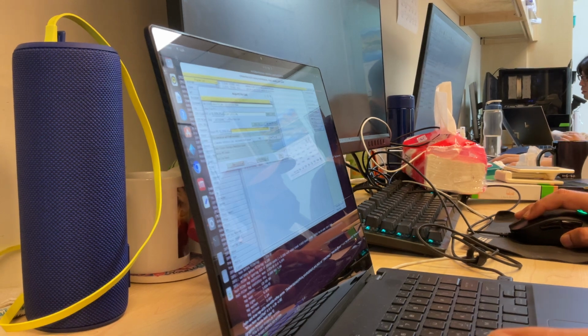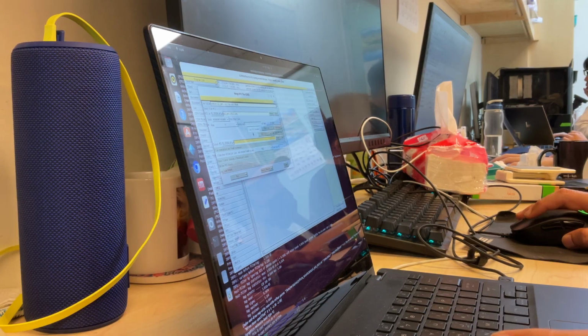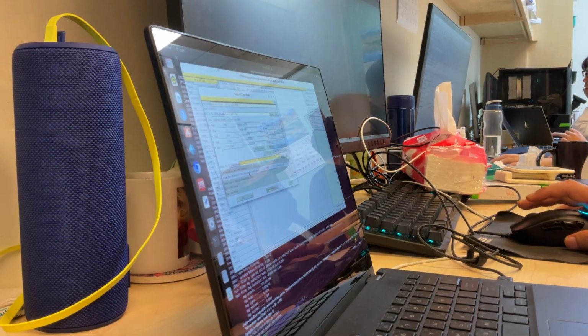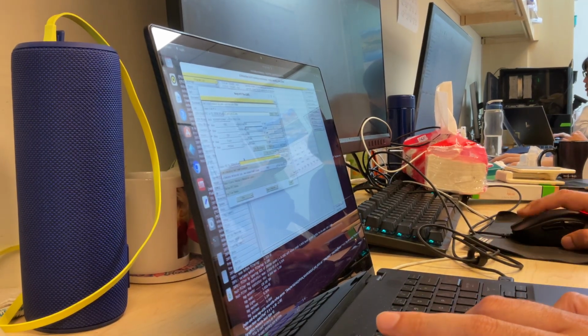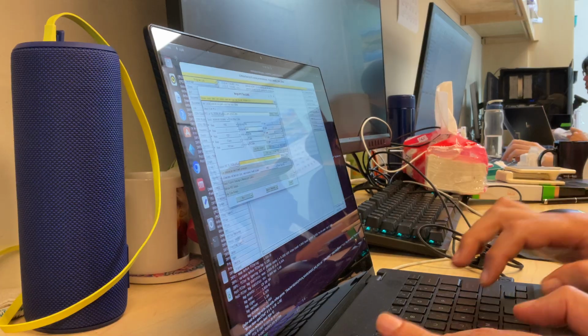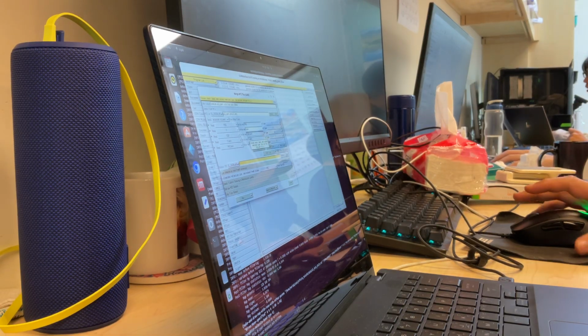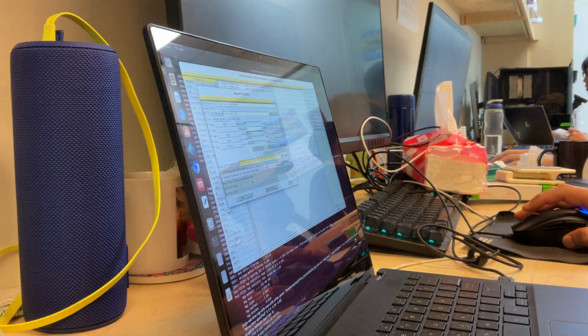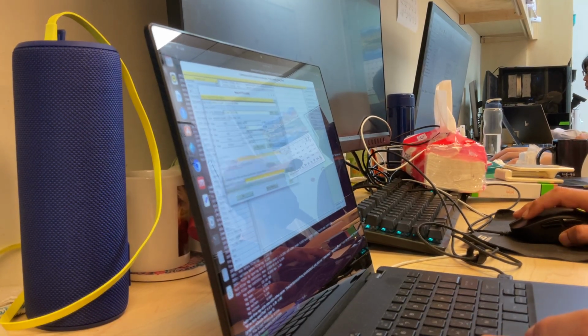Now we are going to show selected columns, list all columns, and we want all of them here. The only thing that we're gonna do, just in case, is call this F dark and sig F dark. Notice the difference between F dark being the experimental one, and FC dark, the calculated one. And now of course we need to add a second one.